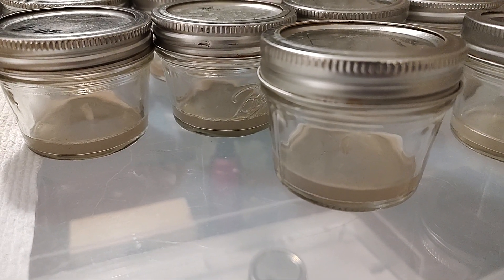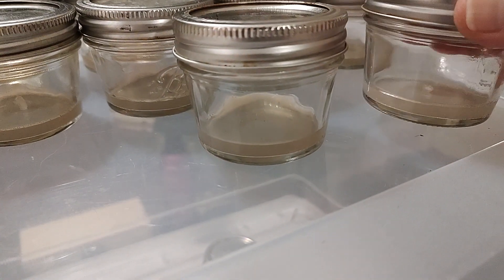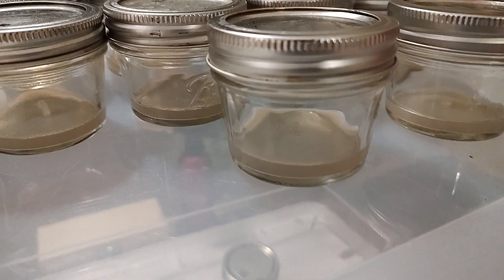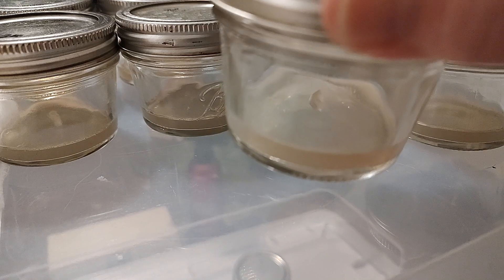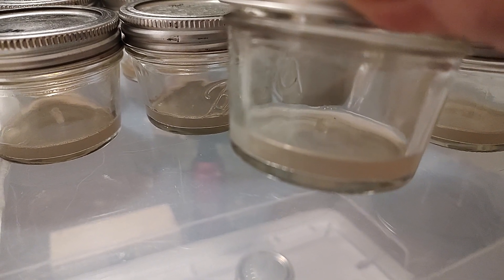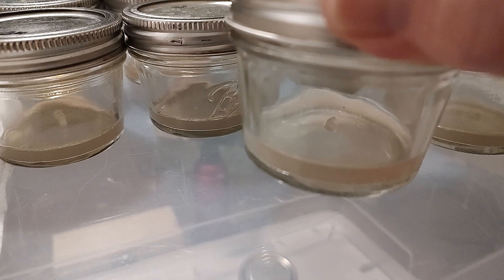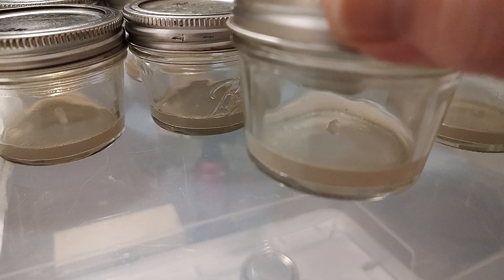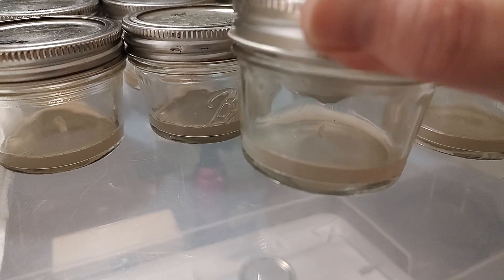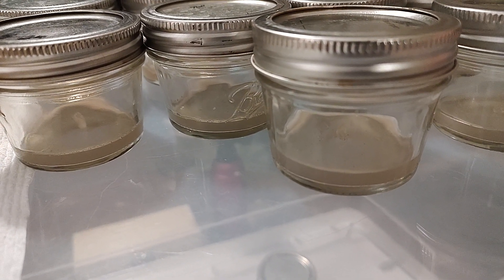You do not want to overcook your agar. It's 20 minutes at 15 PSI. The reason is that you could caramelize the sugars — the dextrose. If you're using water agar with no dextrose or sugar, you're fine, but the recommendation is to allow your pressure cooker to cool down, vent it as fast as you can, and get the jars out. Use a towel or hot pads so you don't burn yourself — but you do want to remove them promptly.